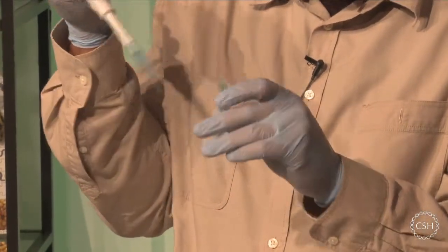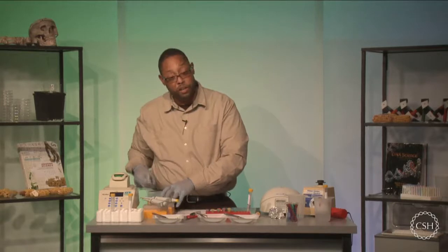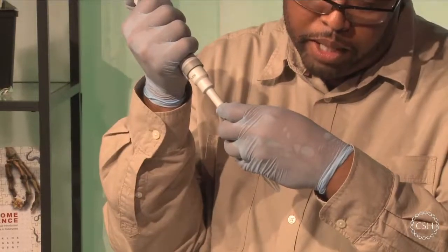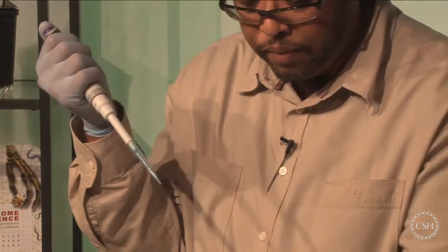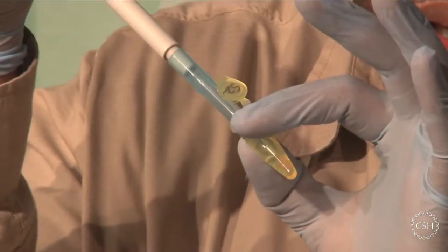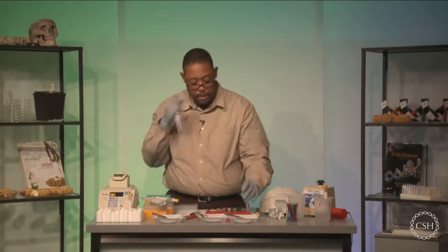It's going to be important that you make sure that your sample is submerged inside of the lysis solution. So if you have to while you're in there, push your sample down with your tip. But if you notice, I'm changing tips each time that I'm going through, making sure that I'm not cross-contaminating. And then finally, we'll do the last sample.